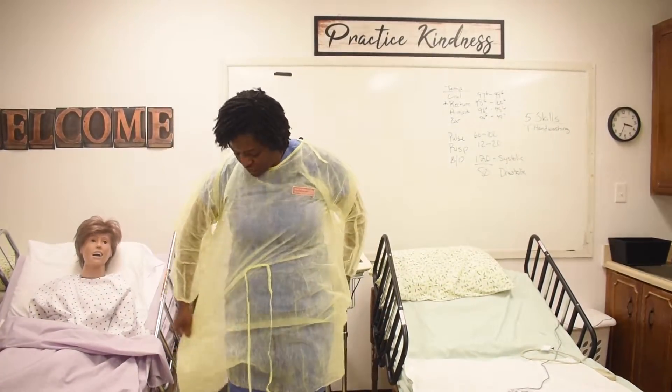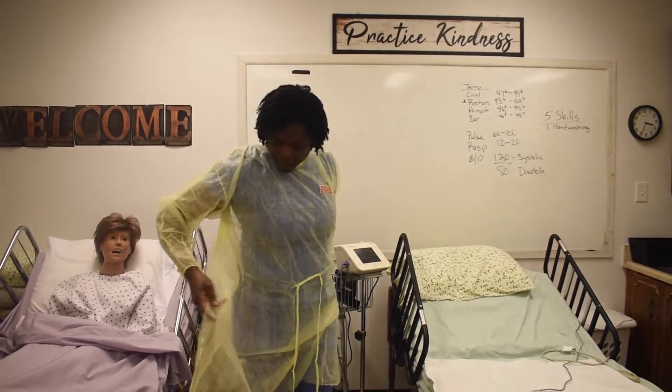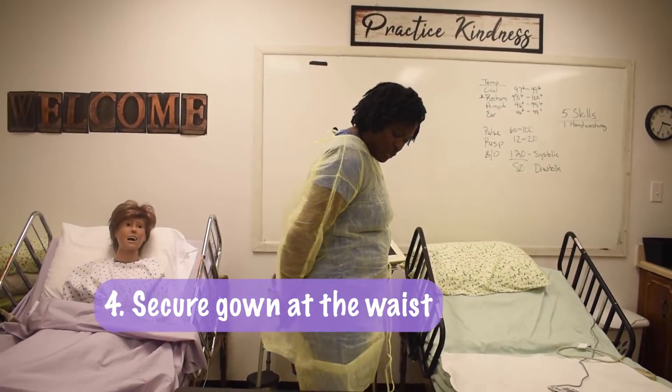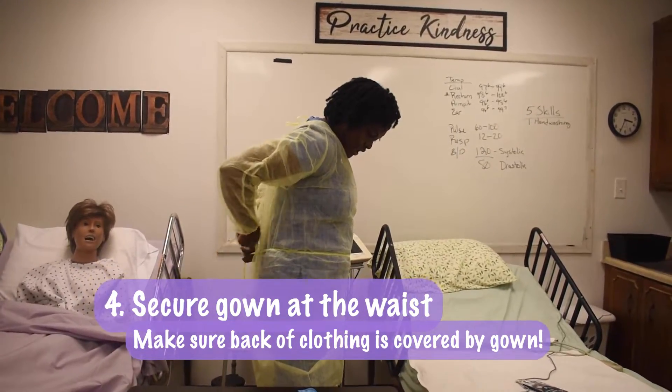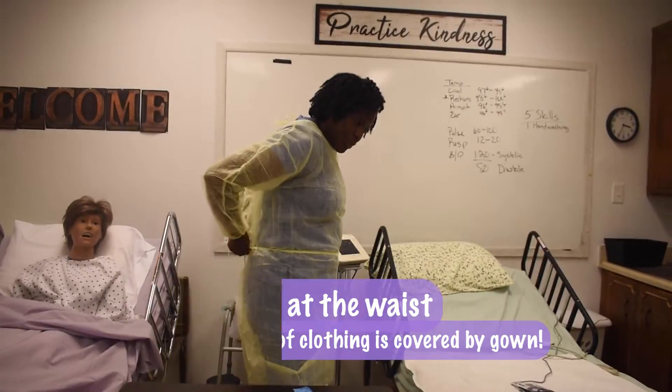We then move down, and we want to cover as much as we can in the back. We're going to tie at the waist.